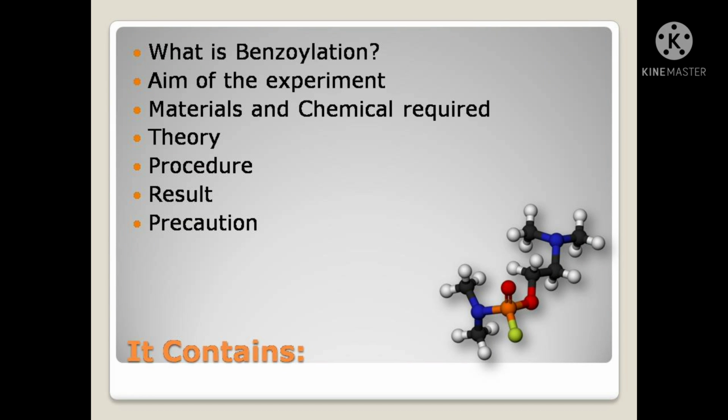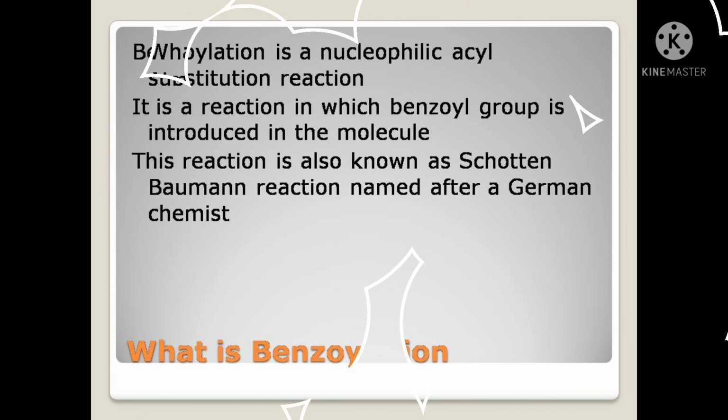This video contains what is benzoylation, aim of the experiment, materials and chemicals required, theory, procedure, results, and precautions. So let's begin the video.